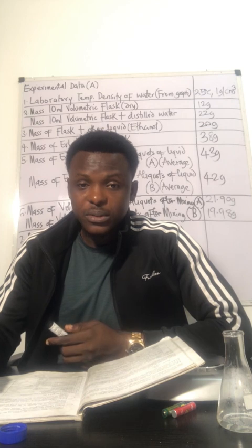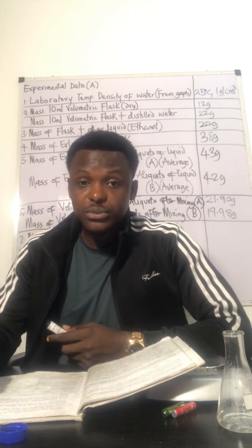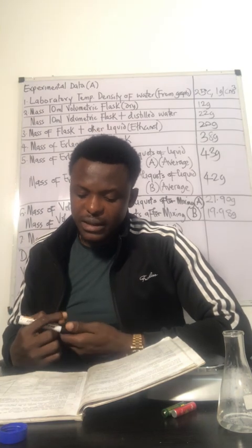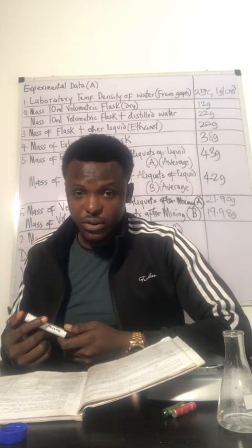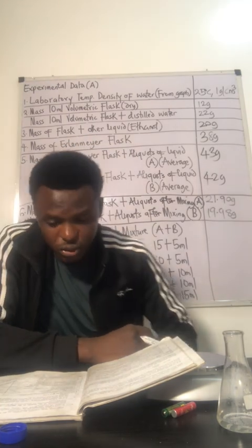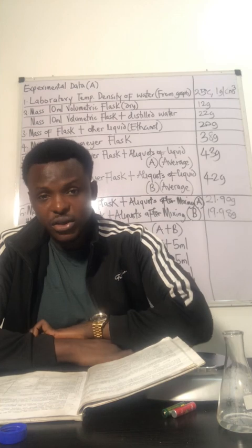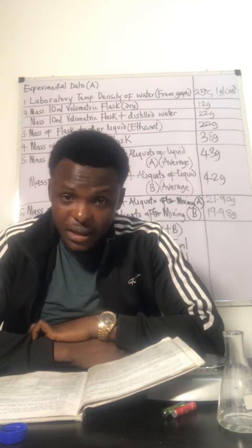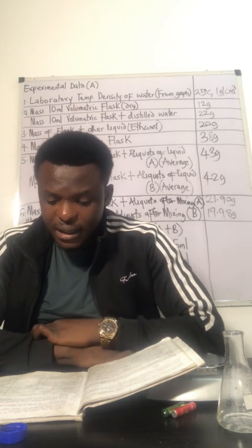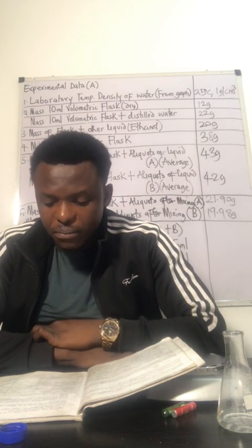Now, procedure 7. They said determination of the density of the mixtures. Now listen, class, listen very carefully. They said after thorough mixing.